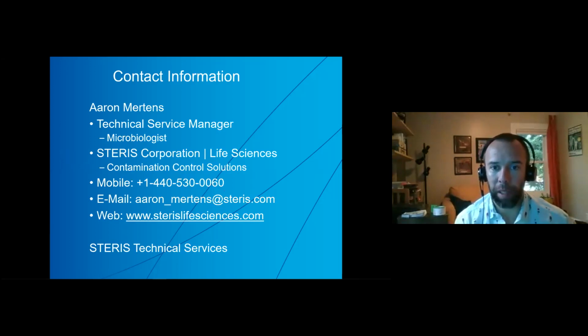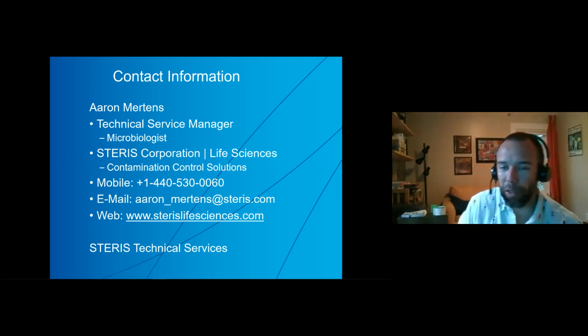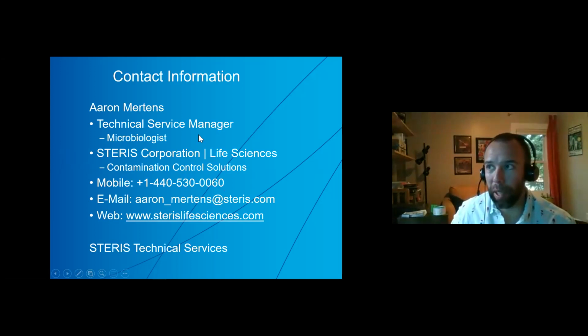So during the cycle development, placing the thermocouples and biological indicators in some test cycles throughout the load, that's where you'll demonstrate with the results from the thermocouples and the biological indicators that you have complete steam penetration and microbiological kill. So it's really the use of the thermocouples and the biological indicators.